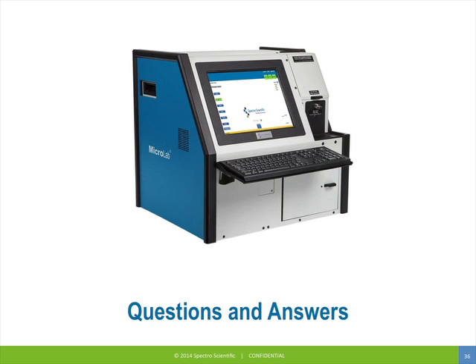Perhaps Jim, that's another one for you. Does the MicroLab have a restriction on viscosity? I think the question really is, what's the viscosity range of oils that can be analyzed? It goes from ISO 10 up to 320, and we do have the ability to go to ISO 680 fluids as well. There's a special attachment that allows us to pump air into the sample and get up to the higher grade oils, so 10 to 680.